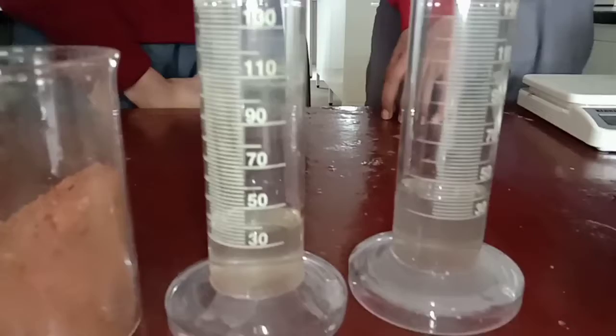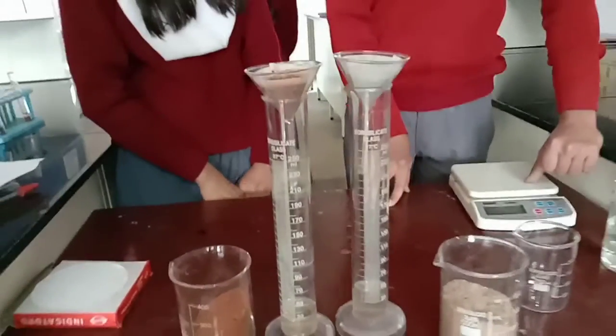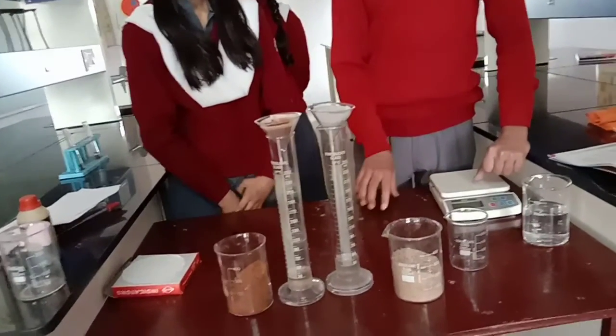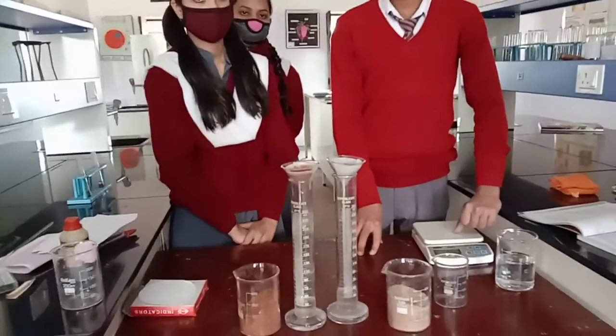After doing the calculation, we'll get the result. Sandy soil has very low water holding capacity, whereas clay soil has very high water holding capacity. It depends upon the space present between the soil particles.